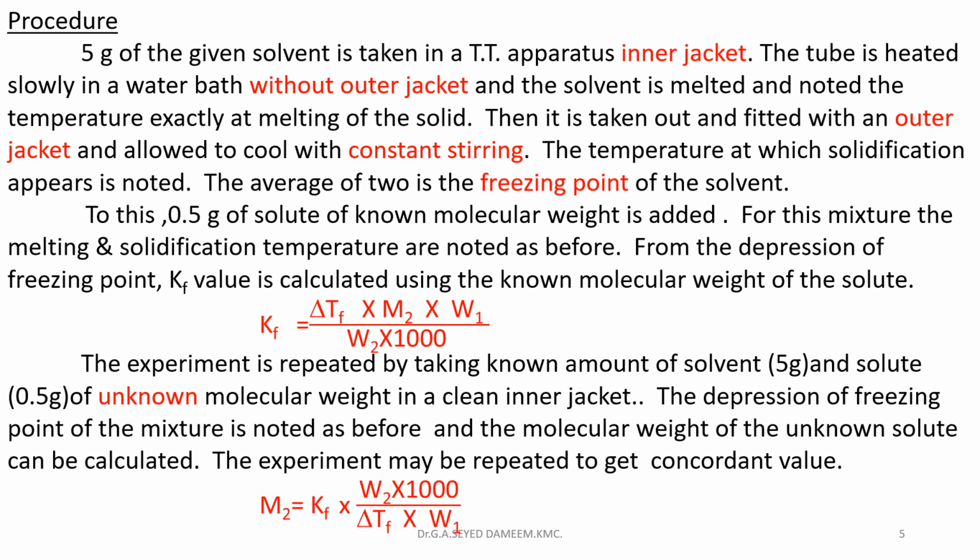Then it is taken out from the water bath, fitted with the outer jacket and allowed to cool with constant stirring, and the temperature at which the solid appears is exactly noted. The average of these two is the freezing point of the solvent. The freezing point and melting point are practically the same, but some small deviation may occur.